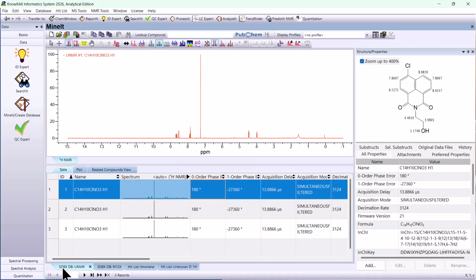I actually forgot to mention this earlier, but KnowItAll itself uses a proprietary database format where you are not required to purchase a third-party database storage library to attach to this. We're using our own proprietary method that has been optimized for data storage of chemistry analytical data. And this also helps improve your search to have very fast searching methods.